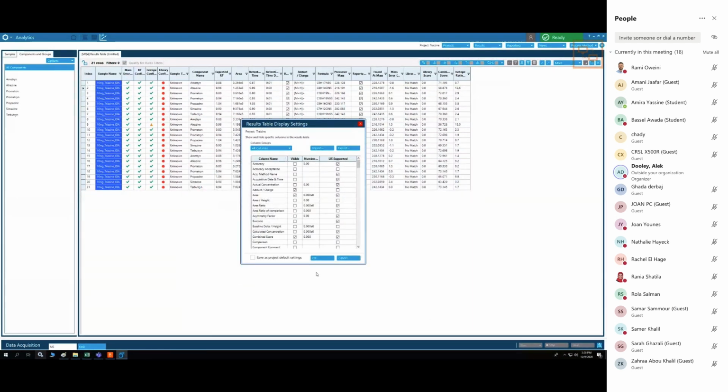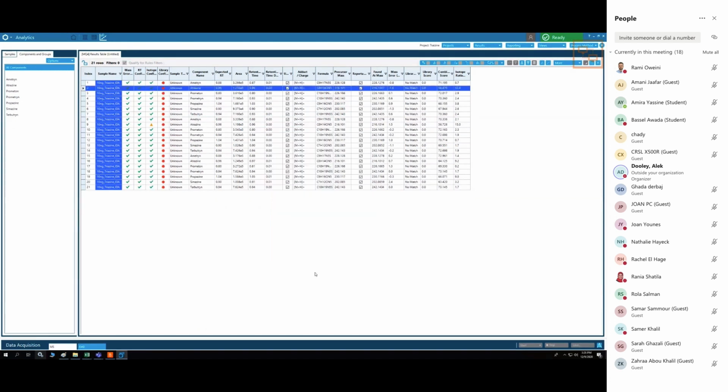So now the next time that you open a result table or you create a result table, you don't have to do all of that work. You can come directly to more, and you can say here under recent table settings, and it has it memorized. So you'll just be able to click there once, and poof, you will get exactly your layout. All right, so that's the layout of the table.